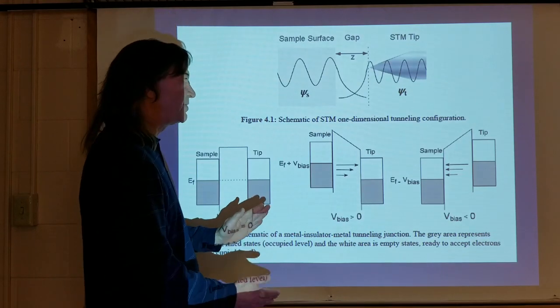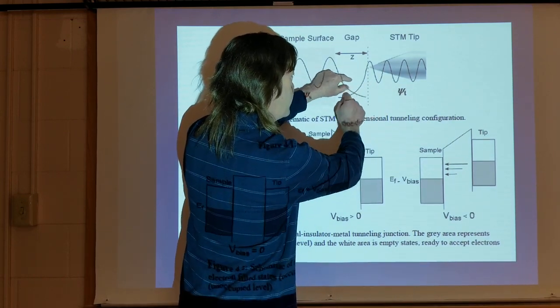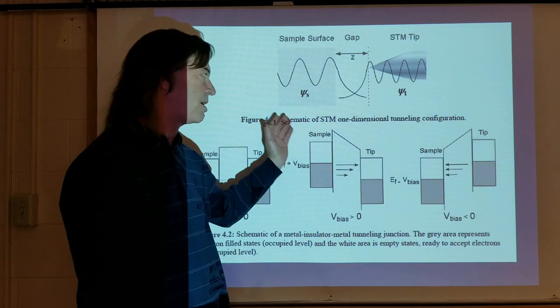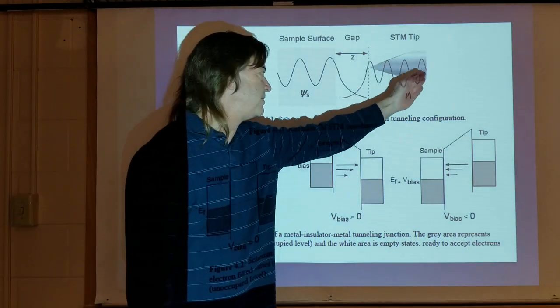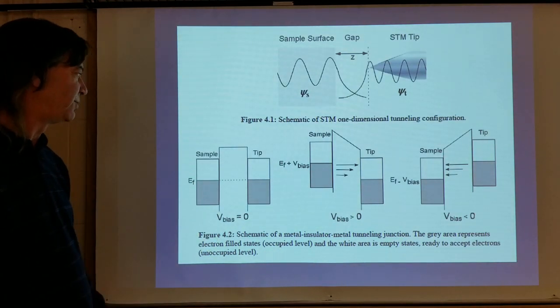Now, if we can actually get these guys close enough, again, 1 nanometer or closer, suddenly these will start to intersect, and they're going to have a measurable actual potential, a voltage, and we'll be able to measure the current of the electrons flowing. Now, if I have no voltage going through the tip and sample, well, naturally, nothing's going to happen. We can't get electrons to jump without giving them a little help of voltage.